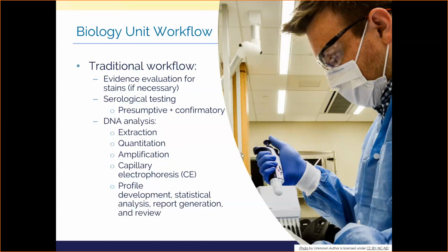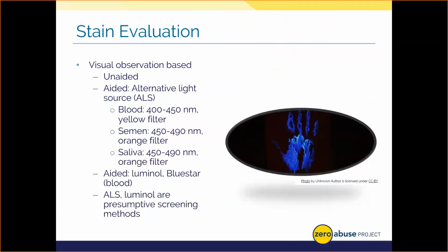Once we figure out the source of the stain and we arrive at the idea that it's a human stain relevant to your case, we have to go through an exhaustive process where we pull the DNA from the cells, see how much of it we're working with, create multiple copies of it to create a rich profile that we then have to review, clean up on a computer, and statistically analyze to determine the probability of that person's DNA profile being contributed then by another random and unrelated person.